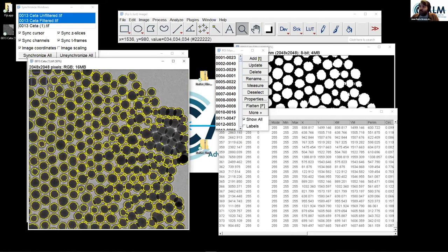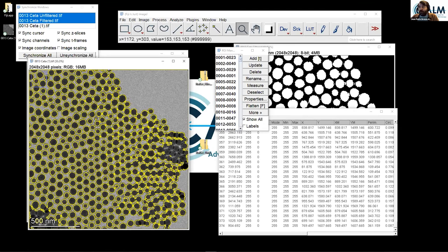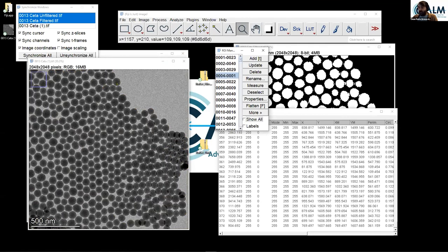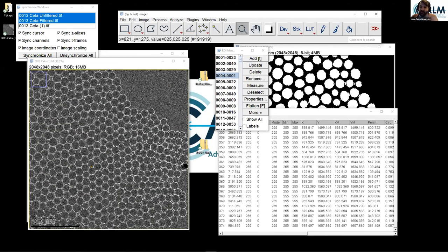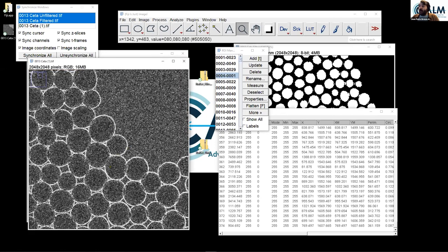One thing that you could do is try to find only the edges of the particles, and I can show you very easily how it can be done. If I select my whole image and go here and choose Find Edges, this applies a kind of Sobel filter which shows you only the edges of your particles. Because I have white objects, it should be easier to find them with Analyze Particles. Then I have my ROIs from my edges, and my ROIs from the center, the bulk of my particle. I'm pretty sure you can think of logical operations to combine both or exclude both and get individualized nuclei. But this is up to you to think about.